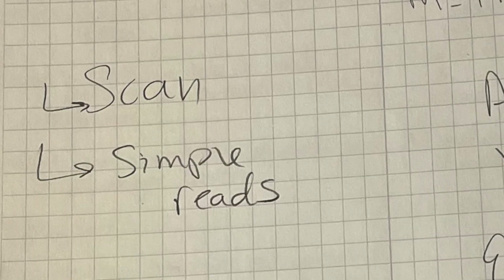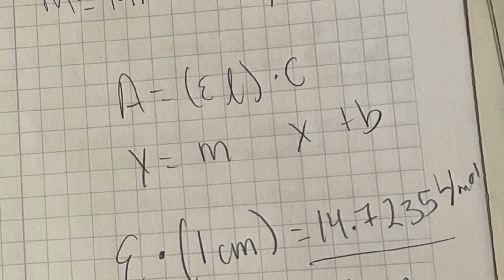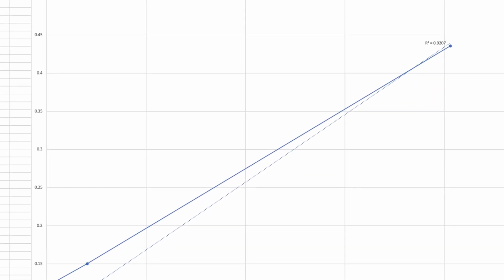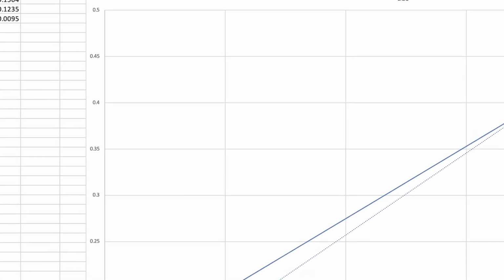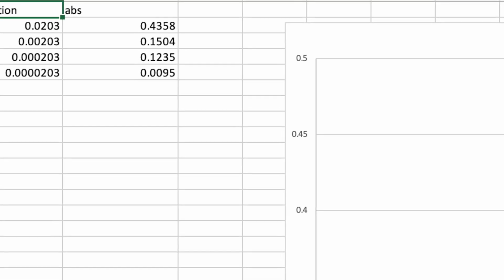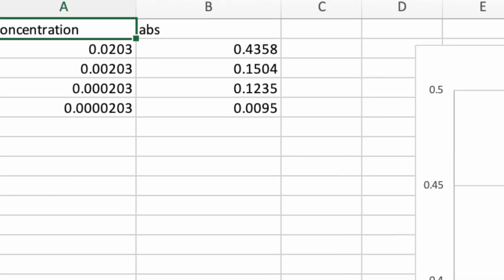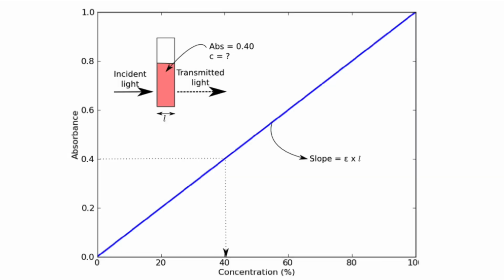One concept that we can begin to talk about when discussing spectroscopy is the Beer-Lambert law. This law informs us of the linear relationship between the concentration and the absorbance of the solution. This is significant because it allows us to find the concentration that was unknown via measured absorption. Failing to zero our scans will result in inaccurate absorbency results, as the machine will be measuring the water cuvette or blank plus the substance when we only want the absorbance of the unknown substance, not the means of dilution and transportation.